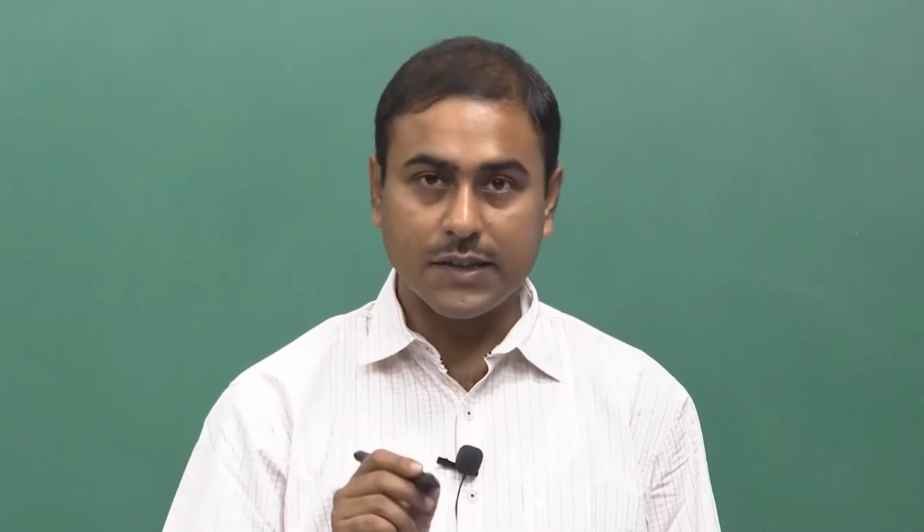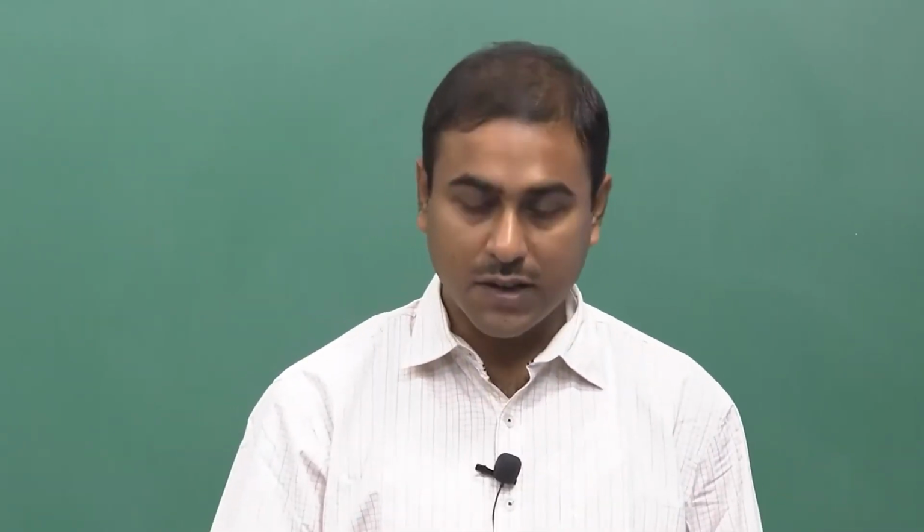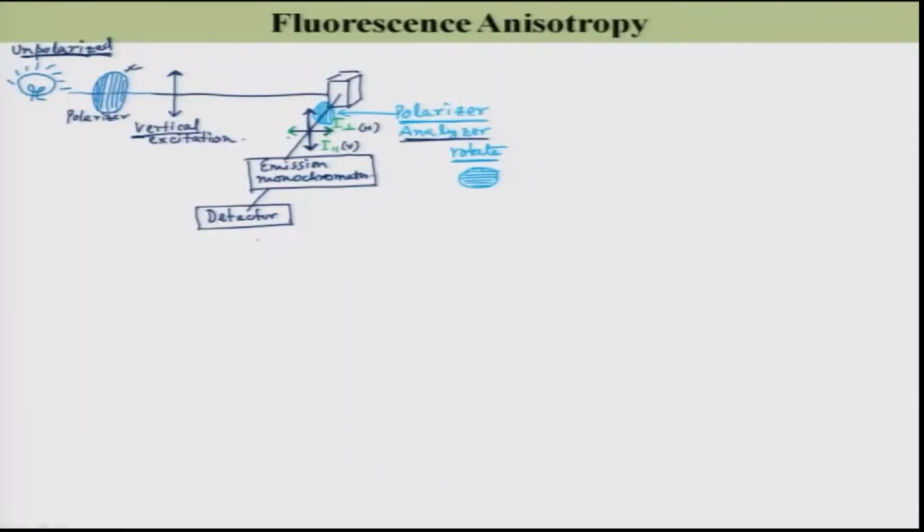So, in this case let me write the intensity detected at the detector for this I parallel light as I parallel multiplied by that sensitivity factor, which I name SV, which is equal to your measured quantity at the detector, correct.